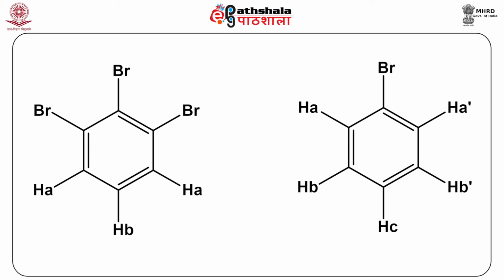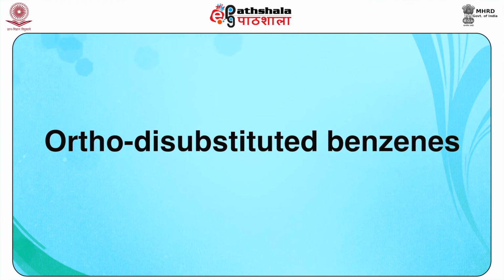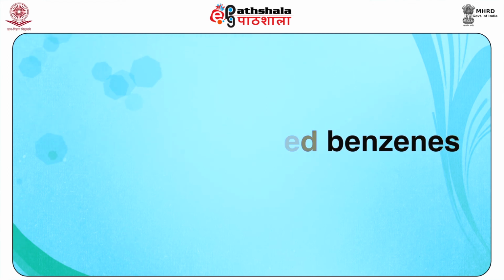Hence, both HA and HA dash protons are not magnetically equivalent. Similarly, students, HB and HB dash are not magnetically equivalent. The magnetic inequivalence can be seen in different aromatic systems, which are described. First, let us consider the ortho-disubstituted benzenes.